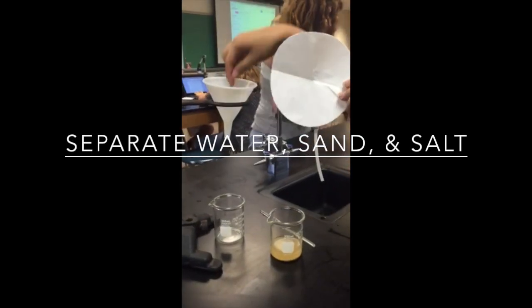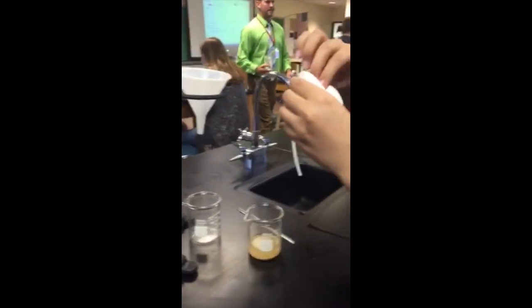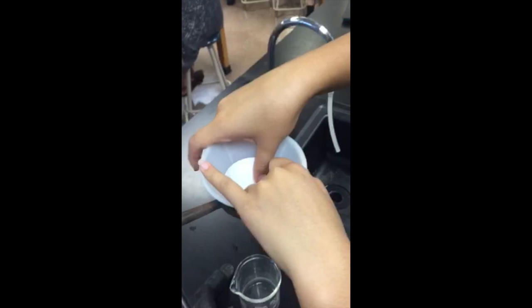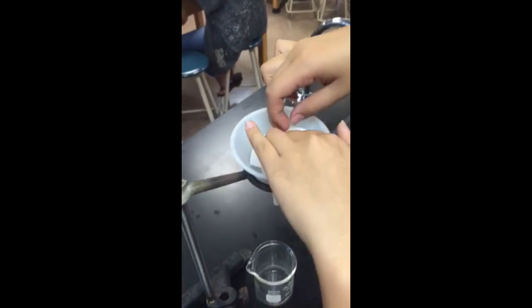I have a piece of filter paper here which we're going to put in here. First we put it in half and then in a quarter. And then I'm going to place it inside my thing. Like so.